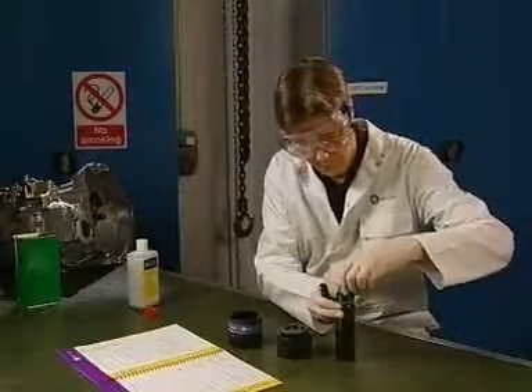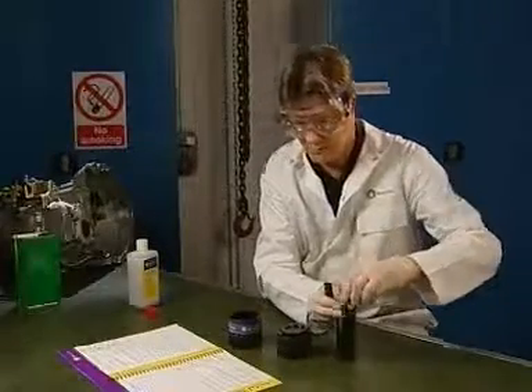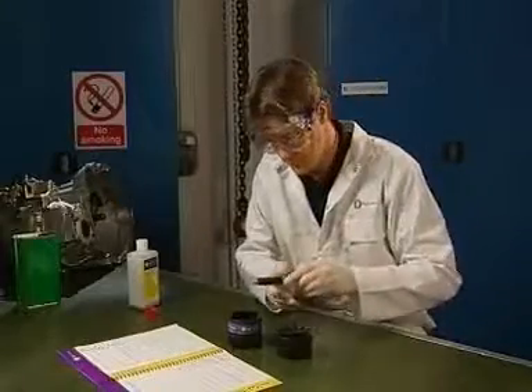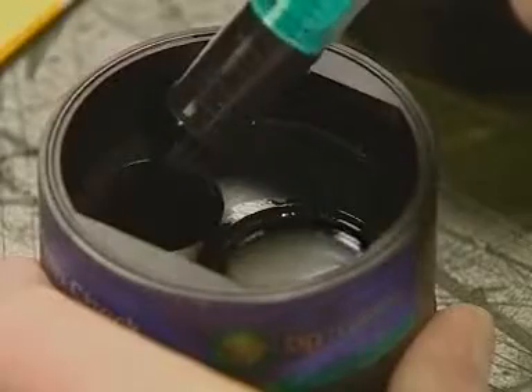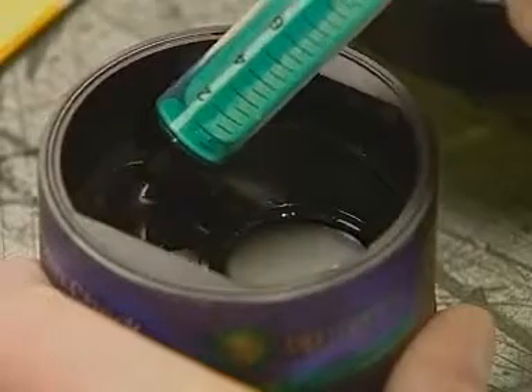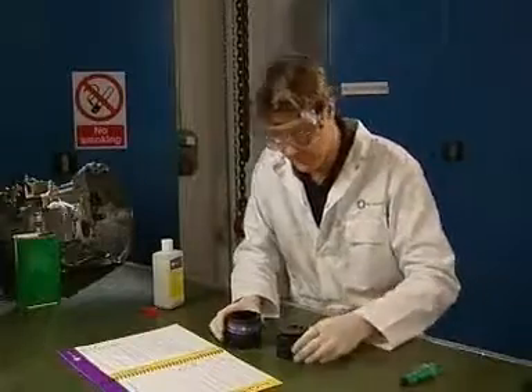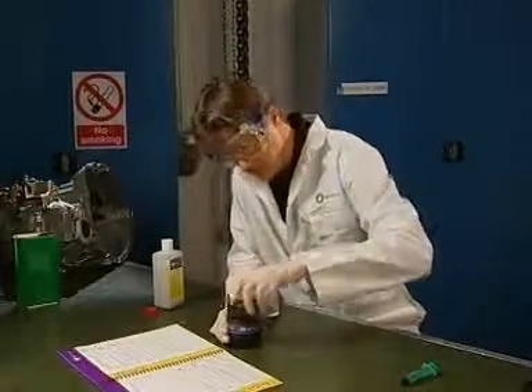Replace the cap. Add the sample to the smaller chamber of the reaction vessel. Close the reaction vessel carefully.